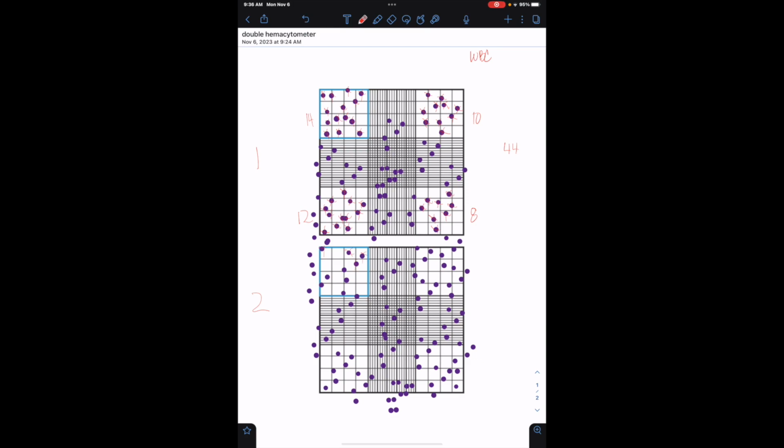1, 2, 3, 4, 5, 6, 7, 8, 9. 1, 2, 3, 4, 5, 6, 7, 8, 9, 10, 11, 12, 13. 1, 2, 3, 4, 5, 6, 7, 8, and 9. 1, 2, 3, 4, 5, 6, 7, 8, 9, and 10. So 10, 13, 23, and 9 is 32, plus 9, which is 41.